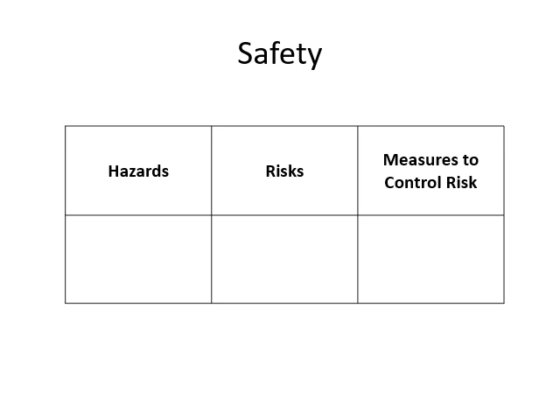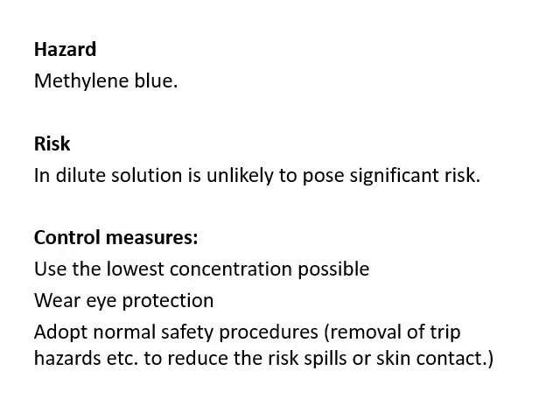So what do we need to know about methylene blue? Well, it shouldn't be ingested. You mustn't eat or drink it. And it has vapours that, if you inhale them, can also be quite dangerous. It's also an irritant to things like eyes and skin.